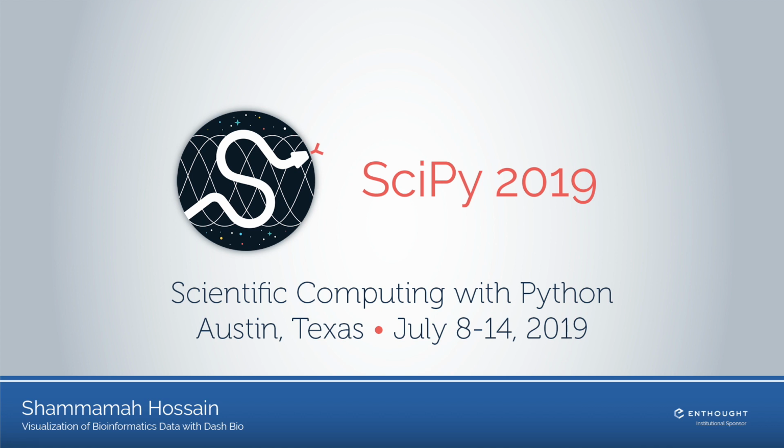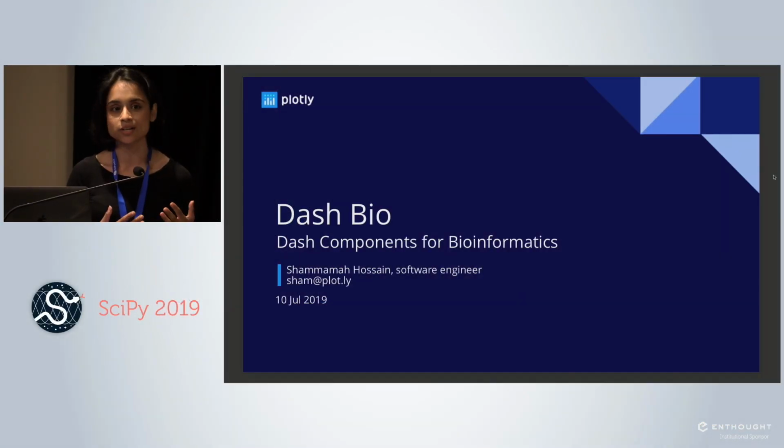Thank you so much. So as was mentioned, my name is Shammamah Hossain, and today I'm going to be talking to you a bit about Dash Bio.